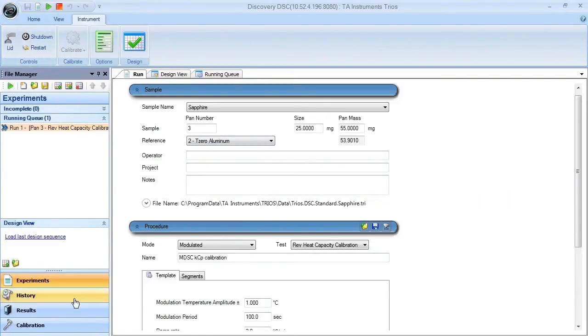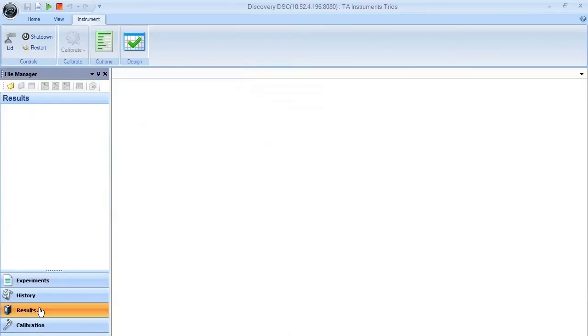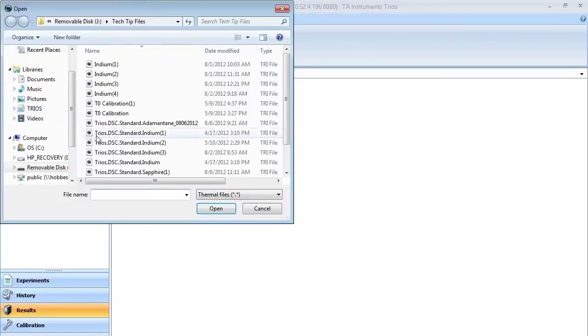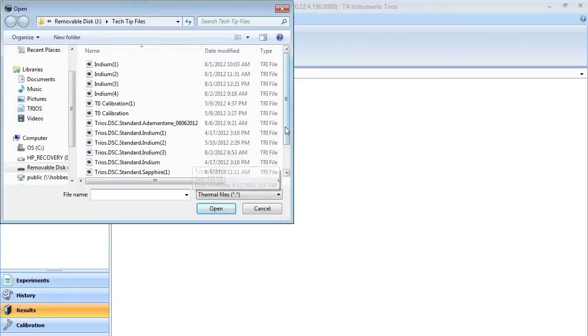Once the experiment is complete, we should be able to see this in the results pane. If not, we can then open these results manually.